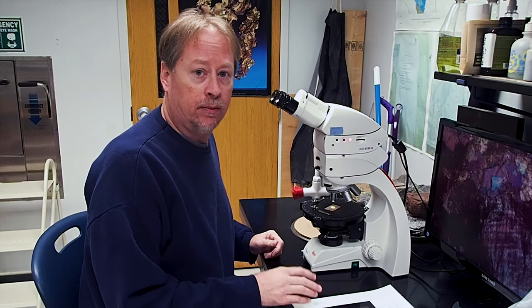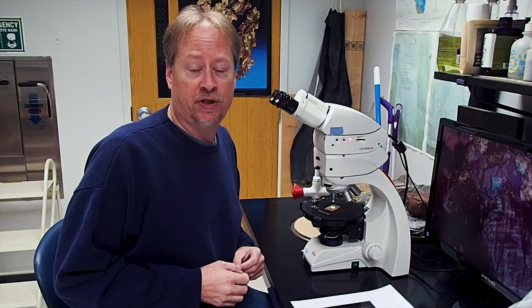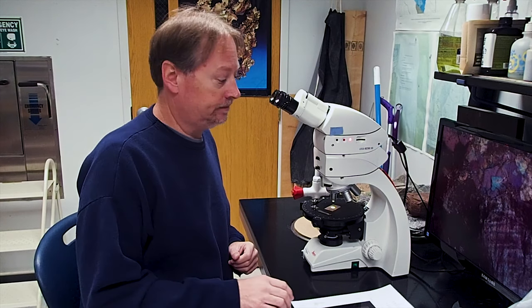I can identify some quartz and feldspar in our aplite sample, so we're getting close, but the colors tell me that we're not there yet. We'll pull our slide from the microscope and return it to the glass plates for some more grinding before stopping again and checking beneath the microscope.